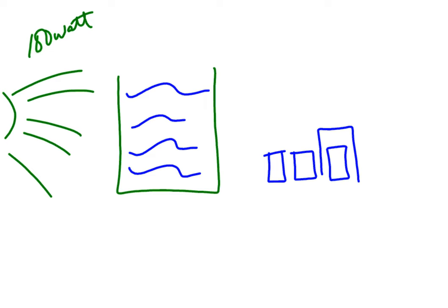But one thing you need to keep in mind is which one's which, because you can't write on the cuvettes and you can't write on the lids. So my suggestion would be to have a piece of tape on the bench and have it labeled with a D, a U, and a B so you know which one's which.